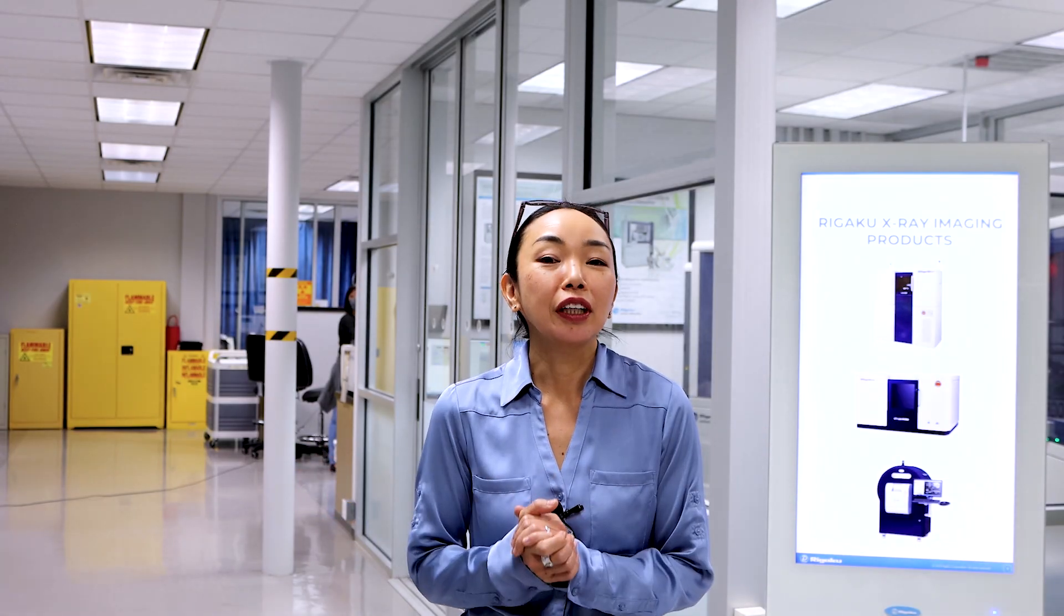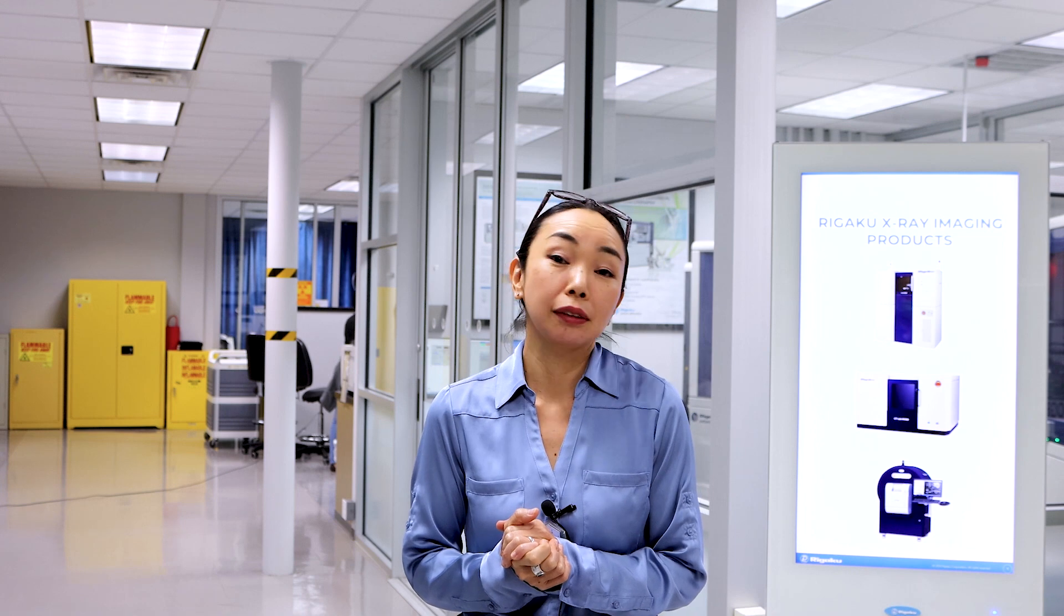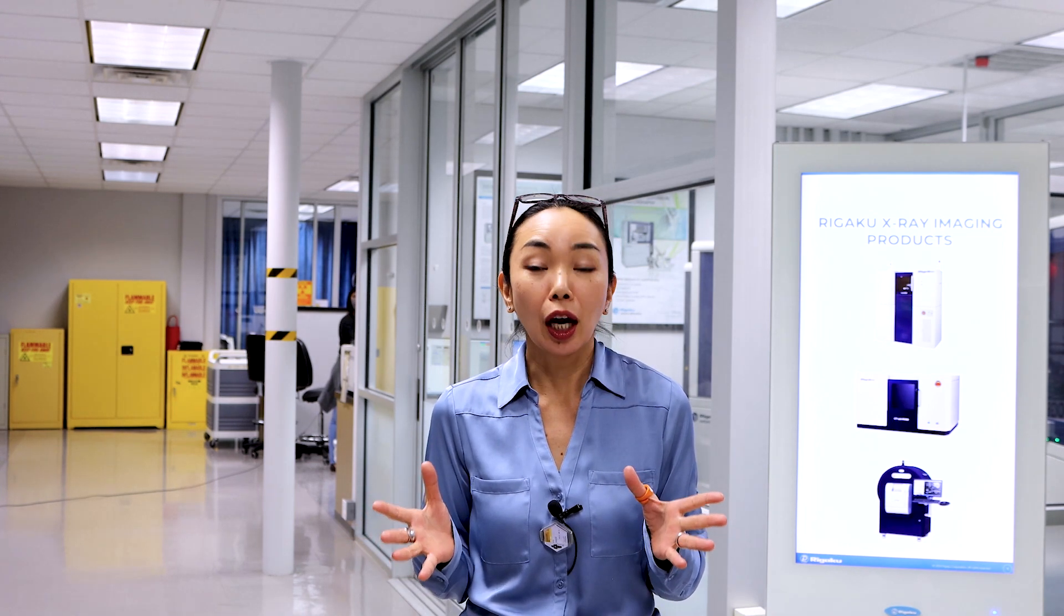Hi. Are you thinking about using a CT scanner for your research, but don't know how it works or what's involved? Well, don't worry. In this video, I will show you the process.